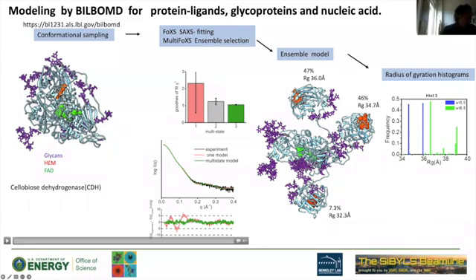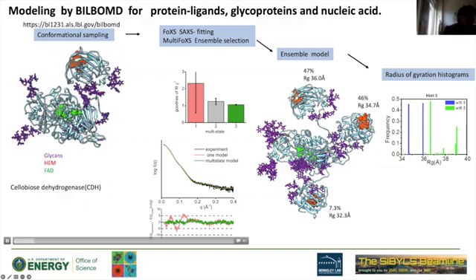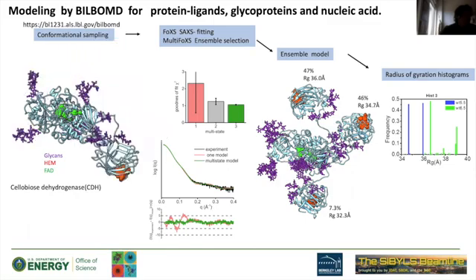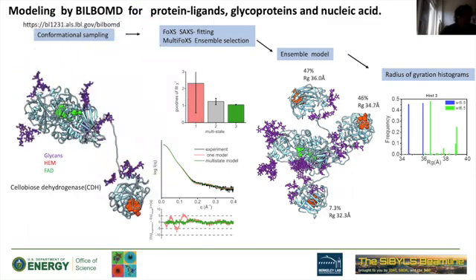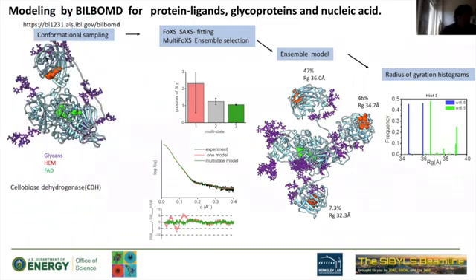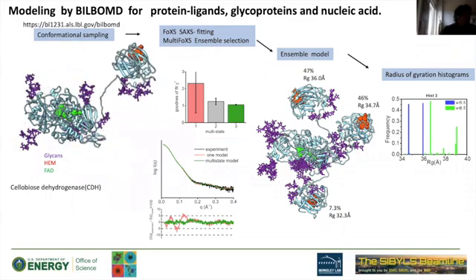But before I go there, this is the example that was mentioned by Dina, that we can use this kind of conformational sampling on multi-domain proteins, or look for allostery by matching the SAXS data with a multi-state model. And again, we already have this view that every piece of structure, including glycans and ligands, corresponds to our SAXS data. So it's important to model all these species together.